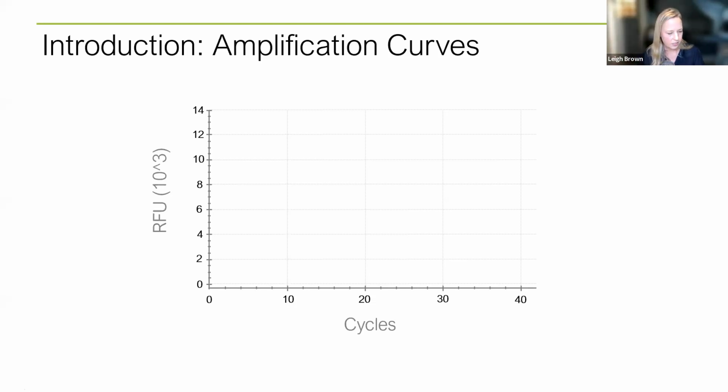And so during the initial cycles of the amplification, the fluorescence is going to be really, really low. Let's say we're using SYBR. Your template is going to have SYBR bound to it, and there will be fluorescence. It's just that your machine will not be able to detect that, right? So it'll just be this background level of fluorescence. And the curve is set to take off. Let me see, I think I've got this animated. There we go. At the point that the level of the fluorescence moves away from this background level. So it's moving away from the background fluorescence. Okay.